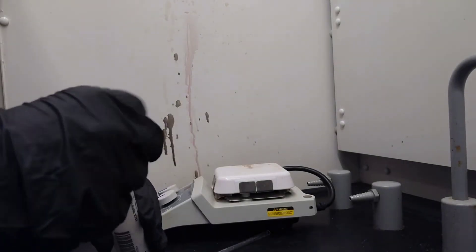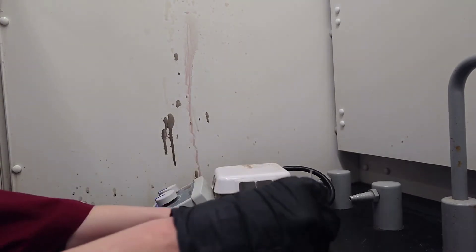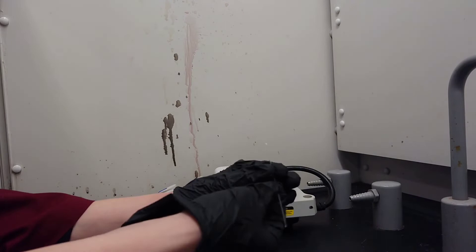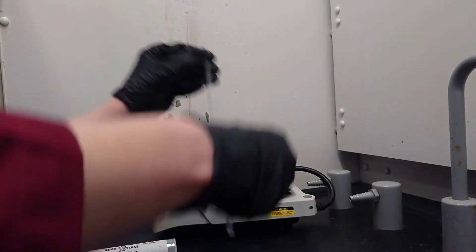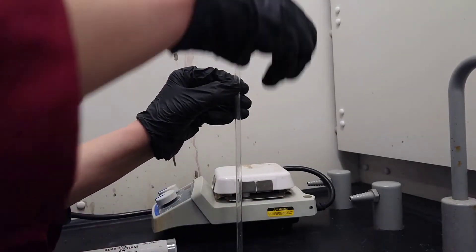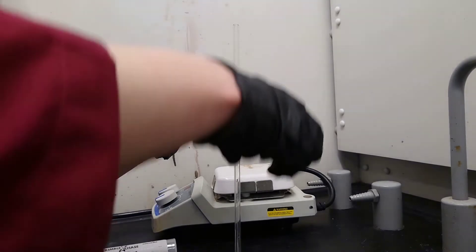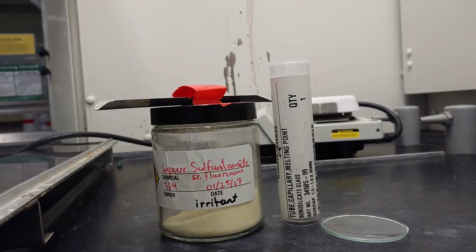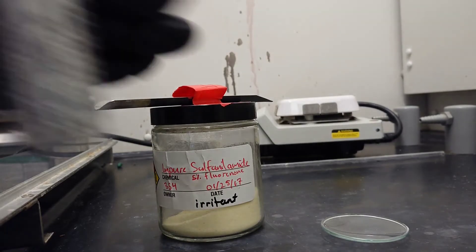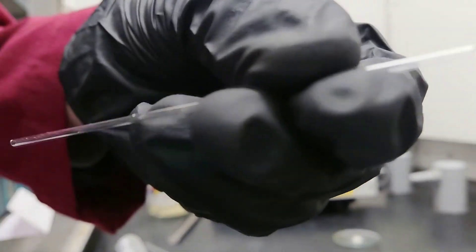Prepare a melting point capillary to measure the melting point of the recrystallized material. Prepare a melting point capillary of the impure material for comparison.